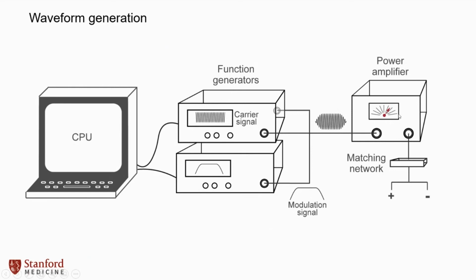This is going to be the most expensive equipment. And then you're basically passing it onto your ultrasound element or transducer. You can put a matching network in between. I do. This is basically to reduce electrical reflections from the electrical impedance mismatch, because ultrasound elements are like supercapacitors. They look very different from wire, and electronic reflections will happen at that interface, but you can block that with a matching network.